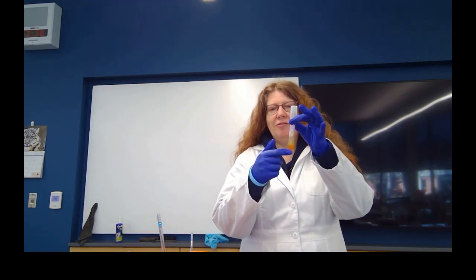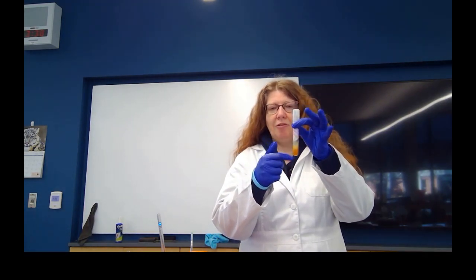Today, we're going to learn how to do 3 different types of techniques that will help us get pure cultures if we're starting from a mixture of bacteria. So, first we have a tube with a mixture of bacteria. Here's our tube with our mixture. And remember, anytime you use a tube of bacteria, you always have to vortex it or mix it vigorously by flicking it back and forth.